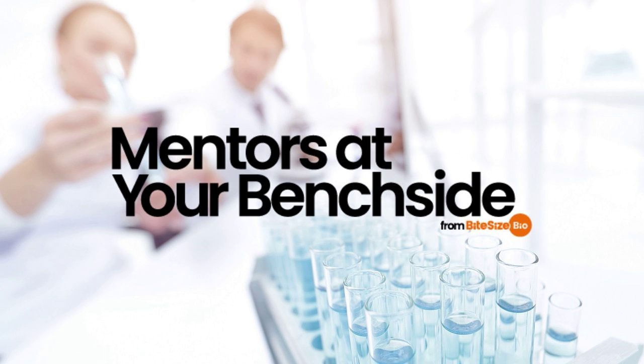I'm Thomas Warwick, and today I'll be telling you about what types of ethanol you should be using for your lab experiments. So, you want to know more about ethanol grades commonly used in the lab. You already know that ethanol is super useful. It's great for killing bugs, setting things on fire, and forcing nucleic acids out of solution. But not all ethanol is created equally, and not all kinds of ethanol are suitable for every task. To help you make sense of your flammables cabinet, here's the rundown on ethanol grades typically used in microbiology, as well as some important rules on how to use them correctly.